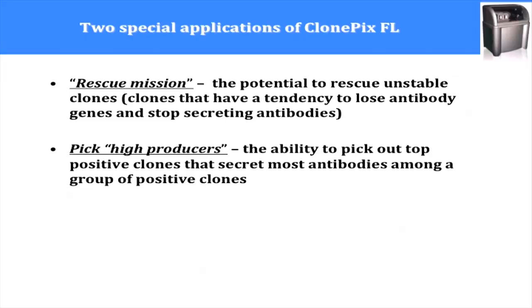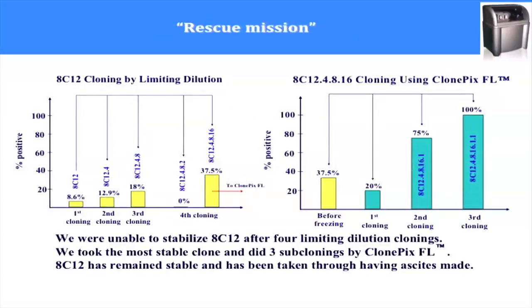Okay, now I'm going to talk about 2 specific applications where the ClonePix FL helped us: to rescue unstable clones, and also the picking of high producers. So this is one very, very unstable clone we worked with. This clone is actually the best clone we had for that particular project, but it was very unstable. It took us 4 limiting dilutions, and we were unable to stabilize it.